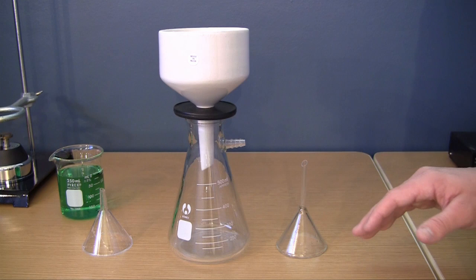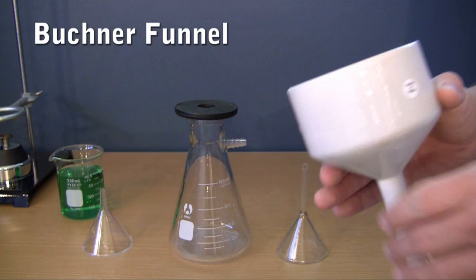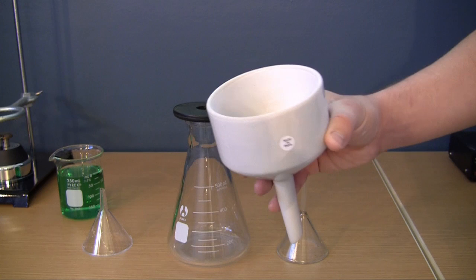And actually there are many different types of funnels other than your standard funnels that you're going to find in the chemistry lab. This is one of the coolest looking ones. This is called a Buchner funnel and if you watch my filtration tutorial you know what this does is basically used whenever you want to filter a mixture like sand and water. Really neat.